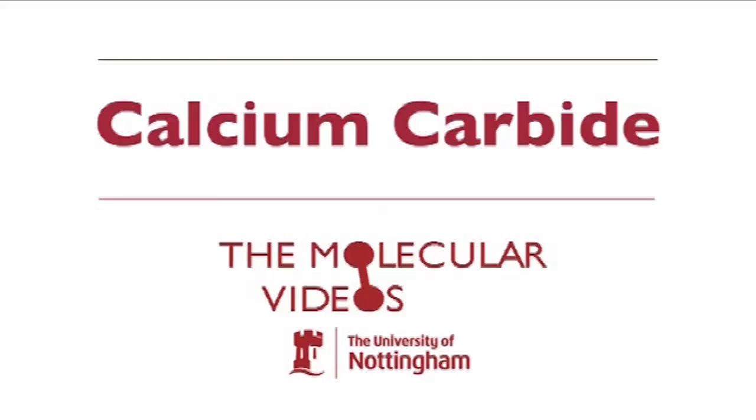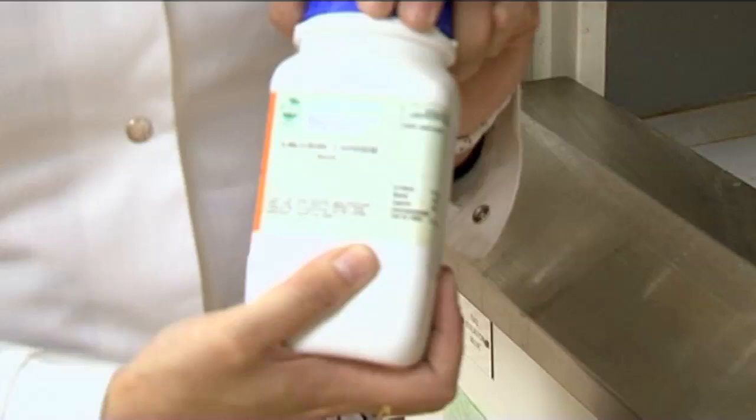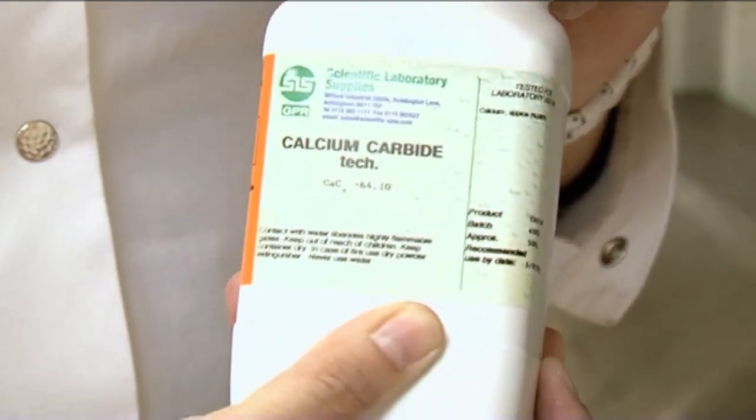We're going to be doing a pretty good experiment today involving the ignition of ice. We've got our trusty chemical — in this case it's calcium carbide, CaC₂.